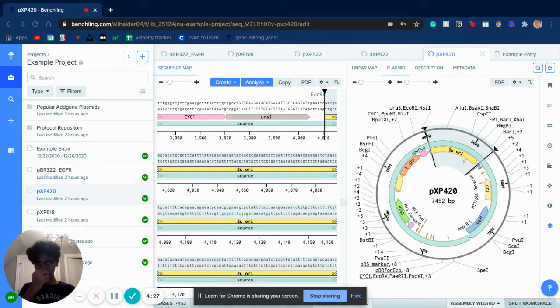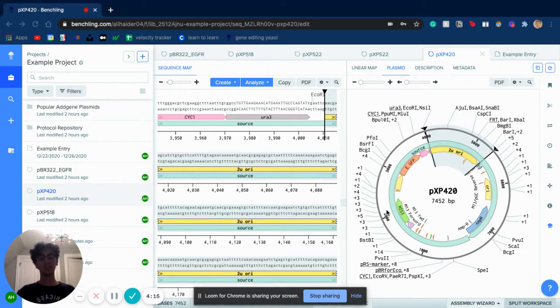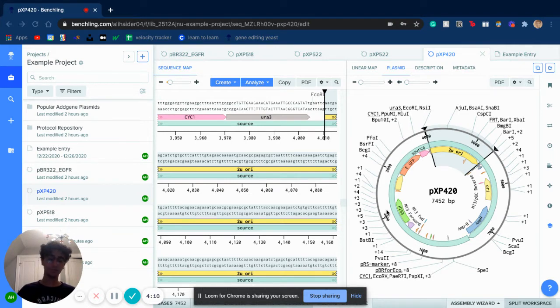I'd like to disclose that this experiment wasn't created by me. I actually used a basis from Stanford Biome — a tutorial they made for their students to understand Benchling, which is a fantastic application where you can visualize and also edit plasmids, as well as take notes and document experiments.